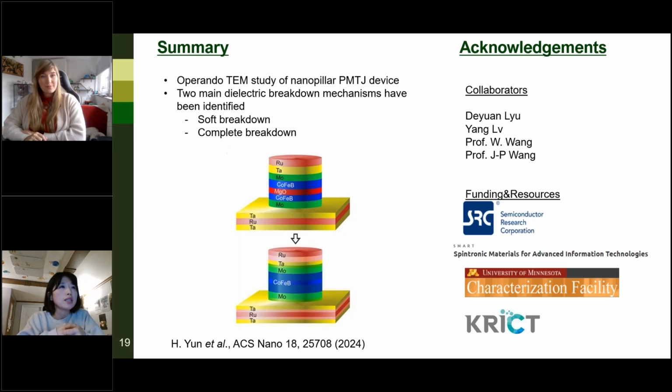When I obtained the low angle ADF-STEM images or medium angle ADF-STEM images, the distinction between the magnesium oxide layer and the tantalum layer was not clear. And also the lattice contrast was not clear in these low angle or medium angle ADF-STEM images.